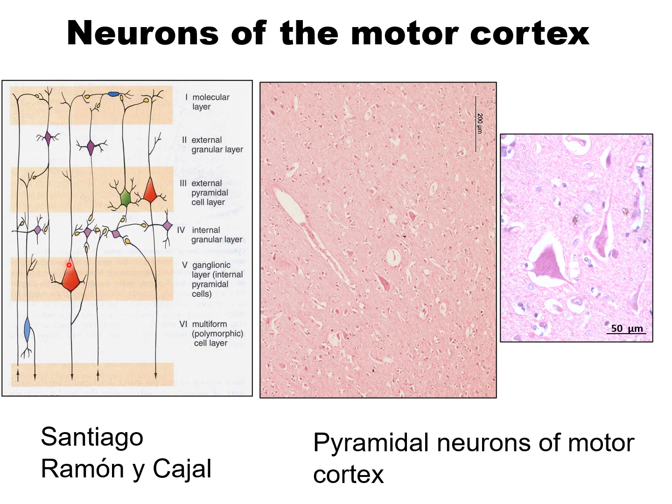These are either pyramidal in shape, or in section it looks like a triangle. The dendrites come out from the apex, and the axons come out from the base. This granular layer contains cells which are present in abundant number in the sensory cortex.